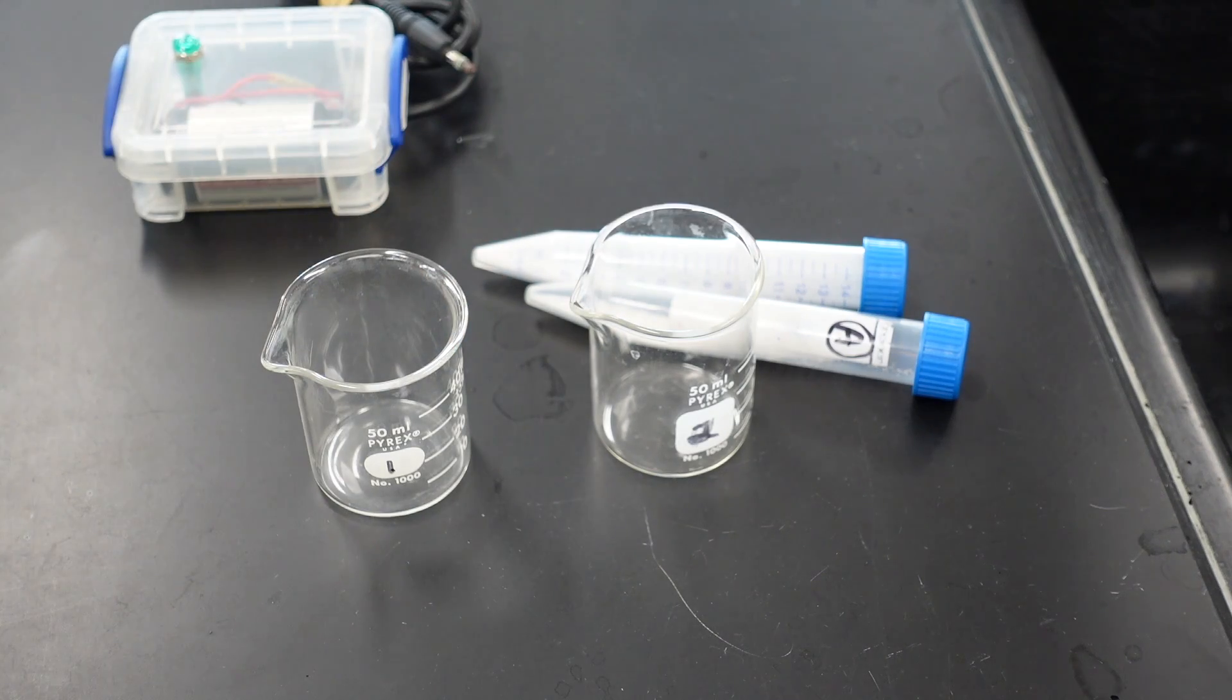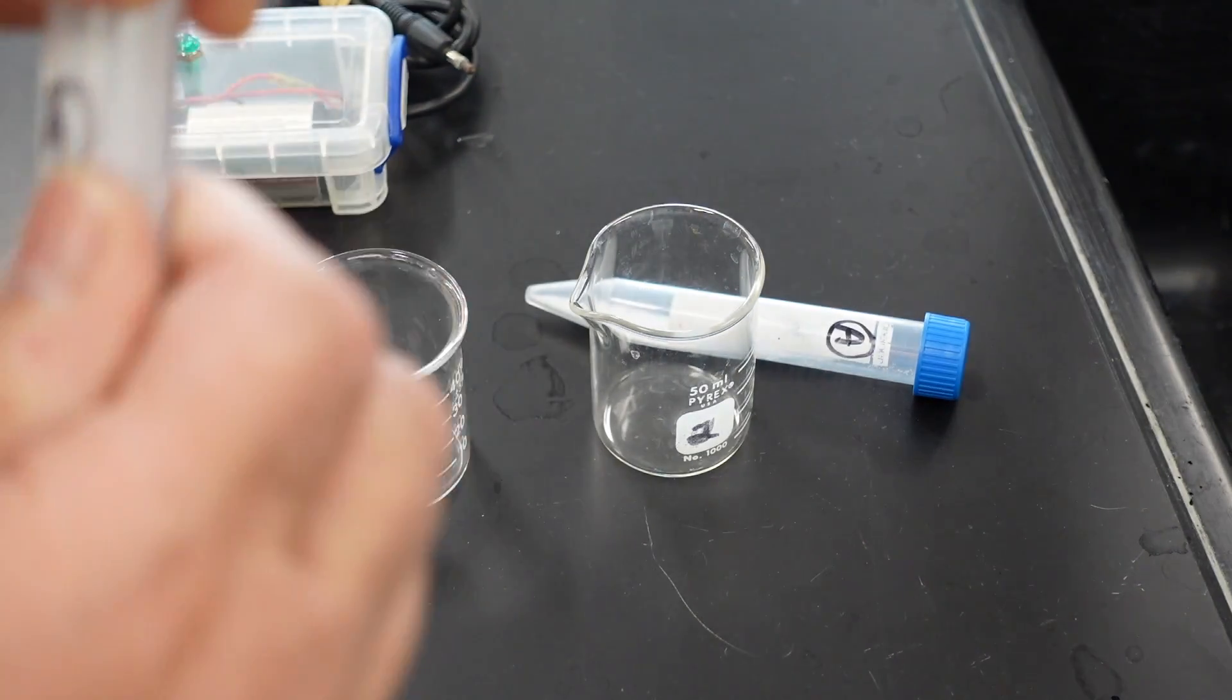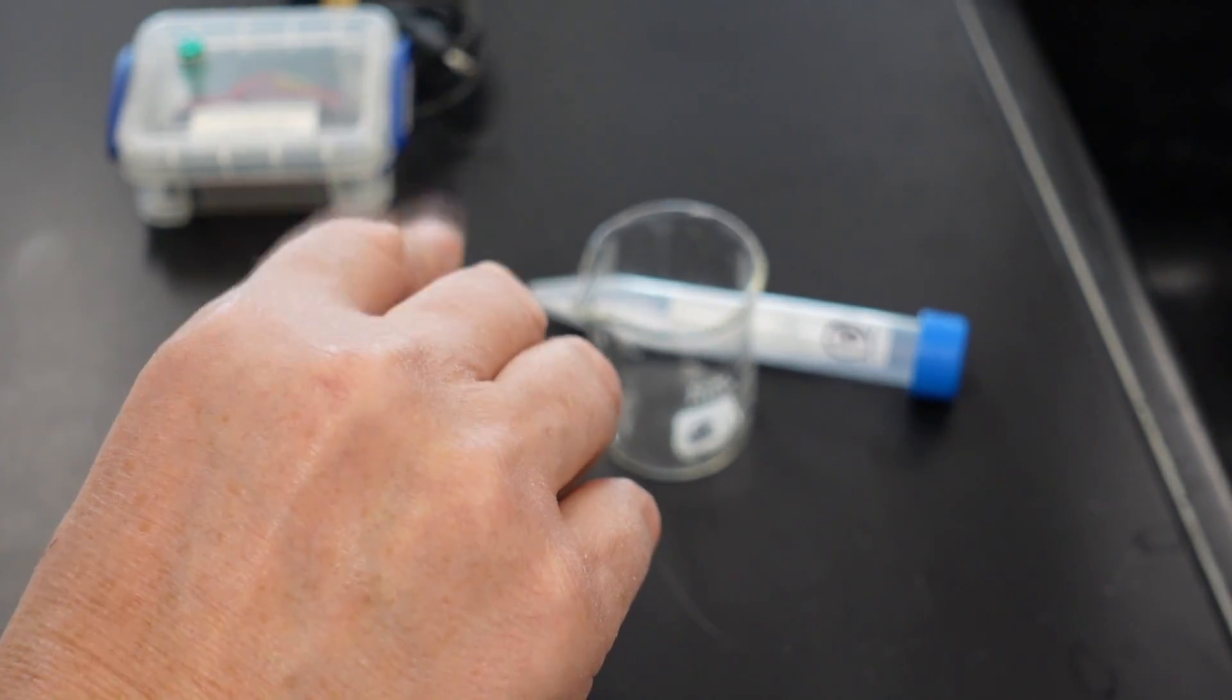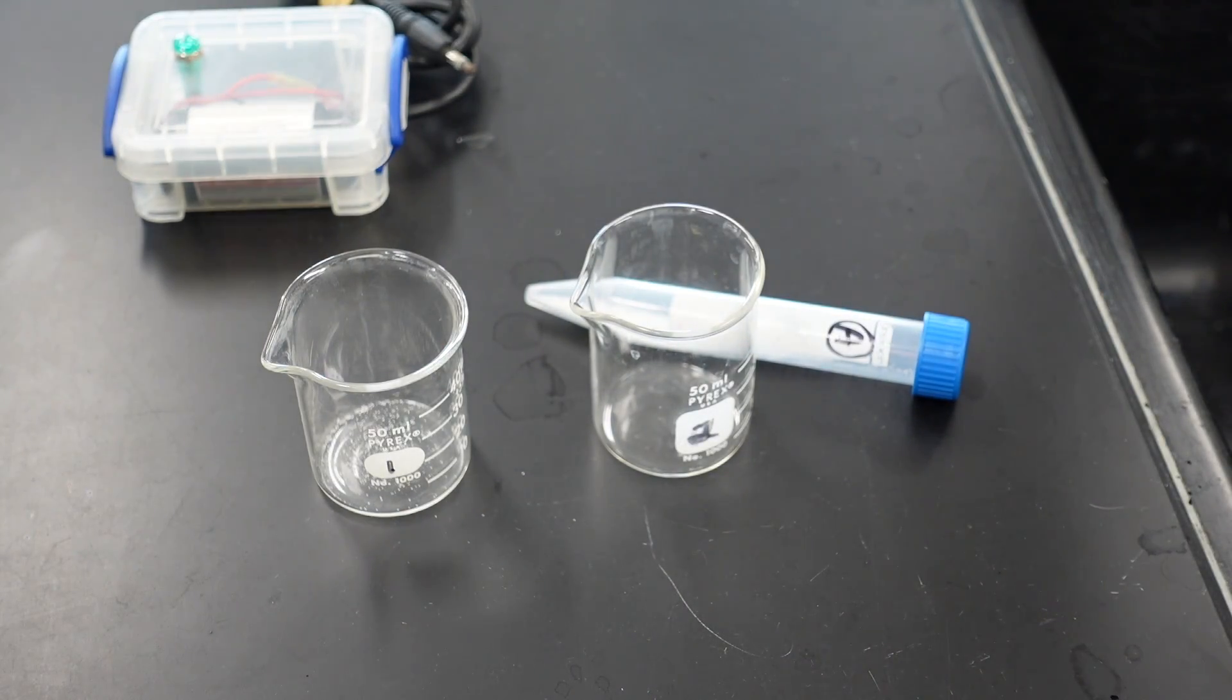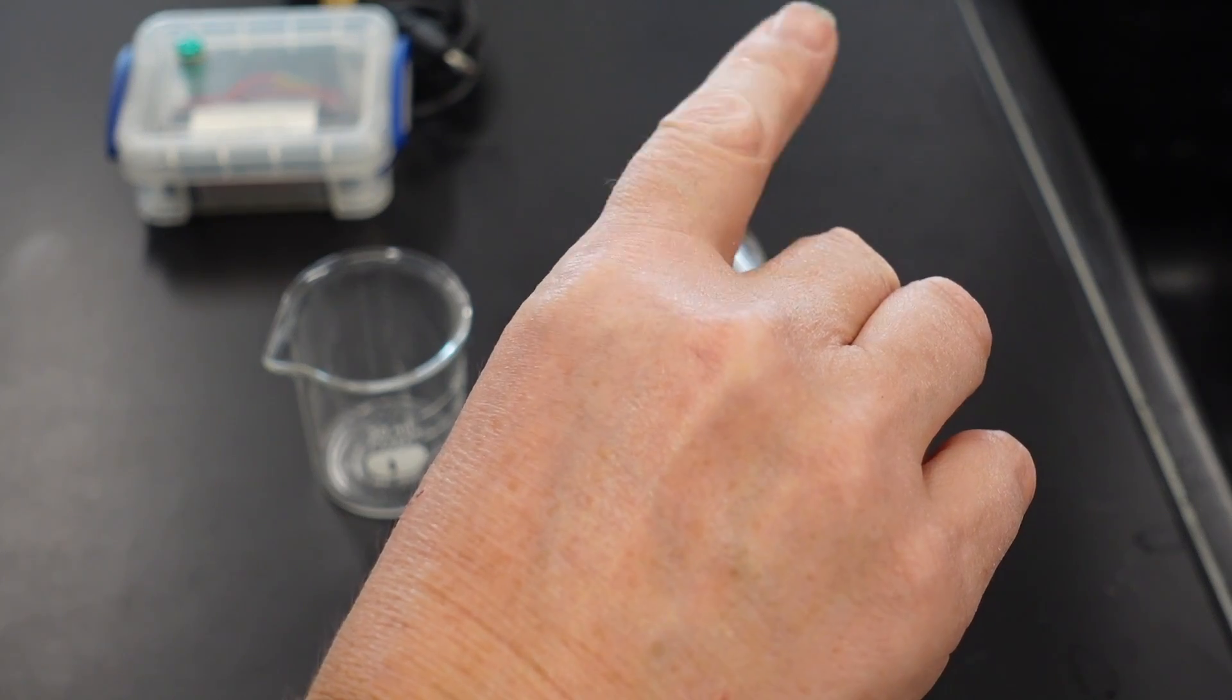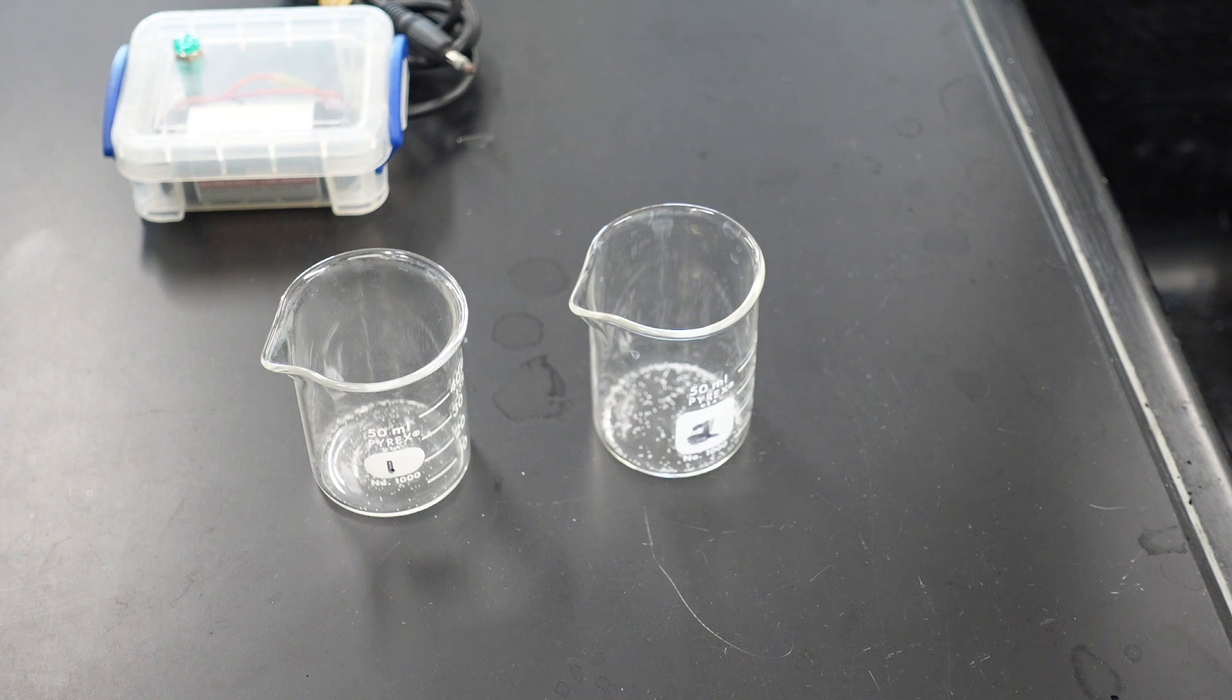So here we have beaker one and beaker two. Into beaker one, I will place a small quantity of substance one. I don't need much. And into the other beaker, I will place a small quantity of substance two. Again, we don't need much.